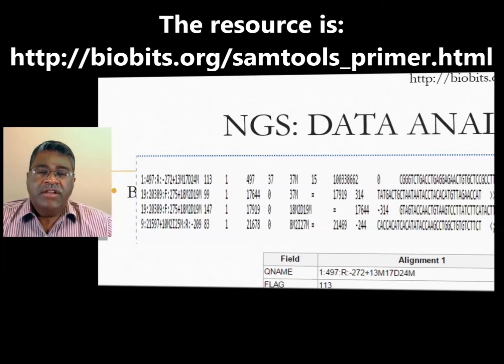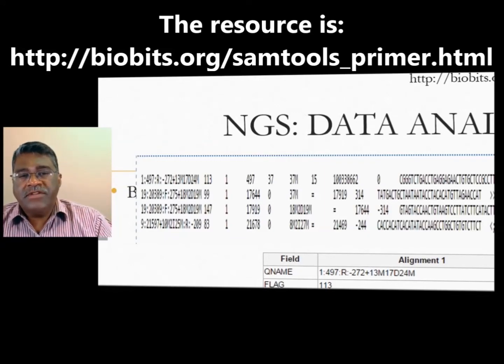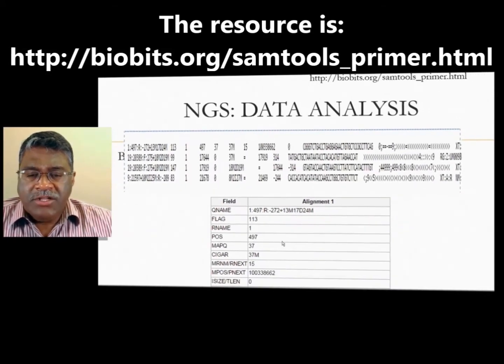Once again, right now we don't have any data, but if you are working with next generation sequencing data, some of the details of these results are easier to understand when you actually have numbers to work with. So I'll talk about a few of these.